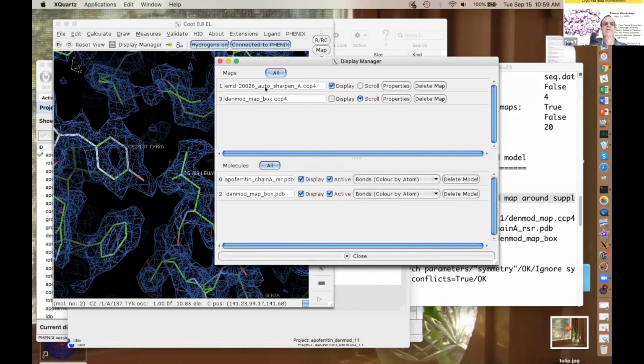In particular, it is possible that side chains on a surface that are not that well ordered could get flattened a little bit. This happens in protein crystallography. We try to make a pretty big mask so that that doesn't happen too much, but that's a potential problem. So yes, and similarly for the lipid belt, same problem.